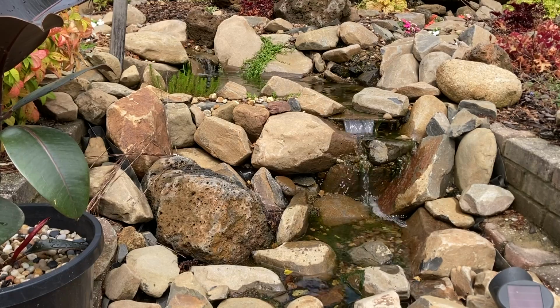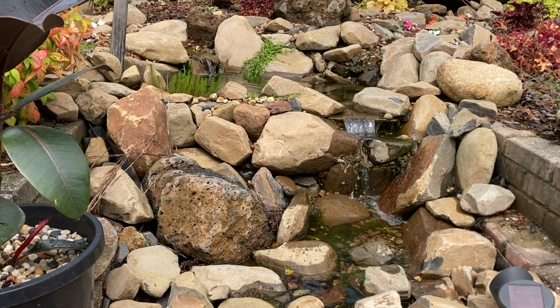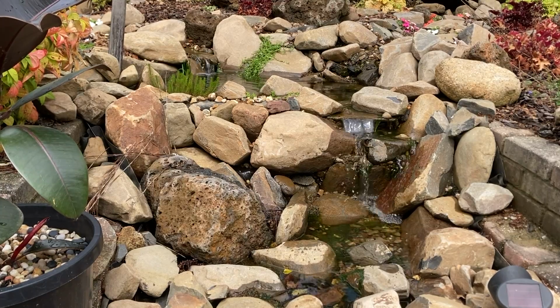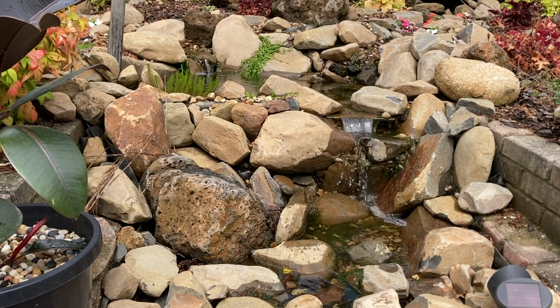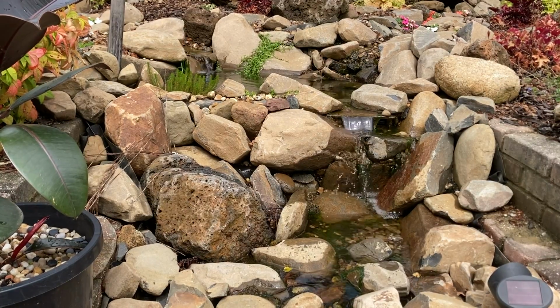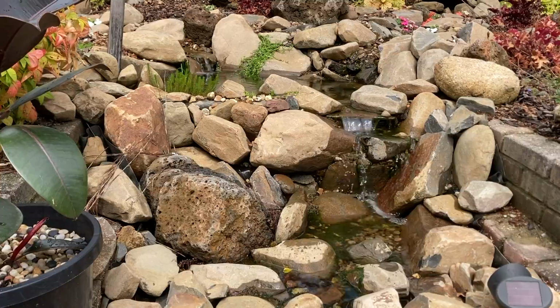So seeing as I was right there, I put the probe in the solar pond and stream. Nothing too unexpected there. The TDS is higher than the other outdoor ponds. That's probably because it sits under these birch trees, and the birds have been having a corroboree up there, and they've dropped tons of leaf material and seeds down into the stream. Also, the original pump died, and it took weeks for a replacement to come, so it was offline for a long time, and it went really gross.